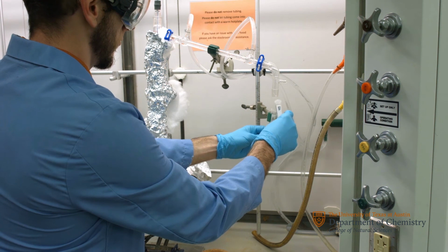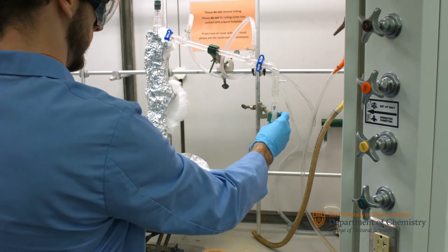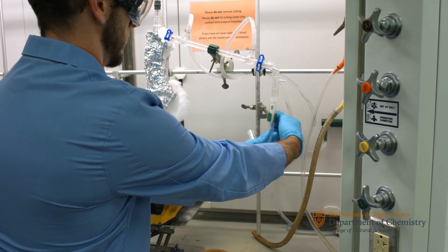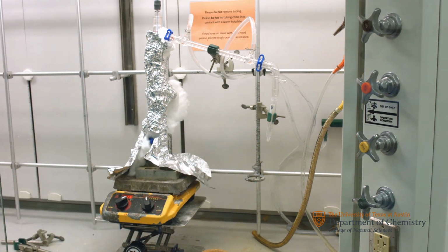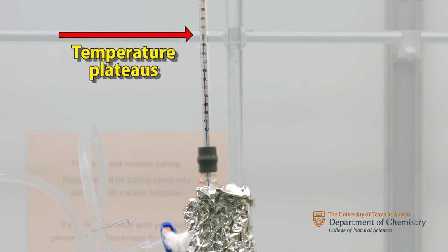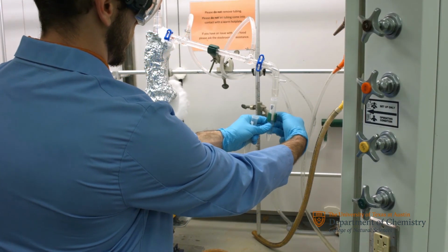Switch tube A with tube B. Try to avoid losing too much distillate. Place the cap onto tube A. Continue collecting distillate in tube B until the temperature starts to plateau a second time. Now switch to tube C and place the cap onto tube B.